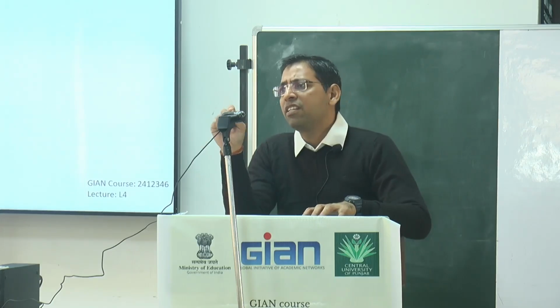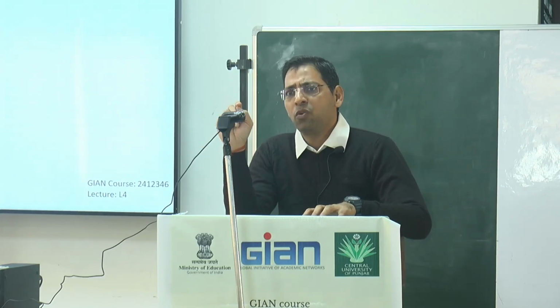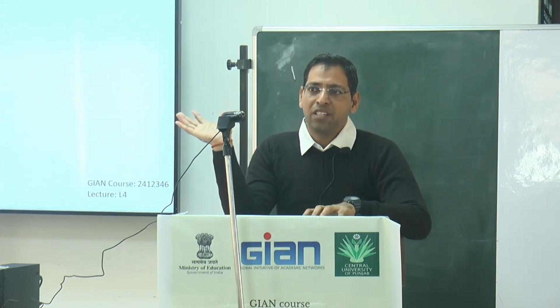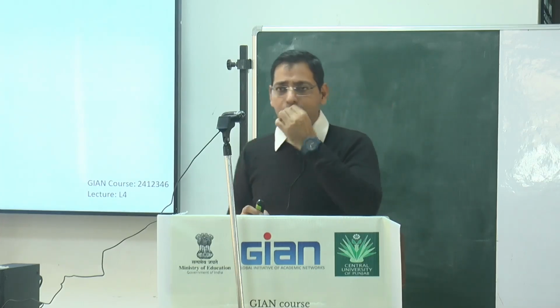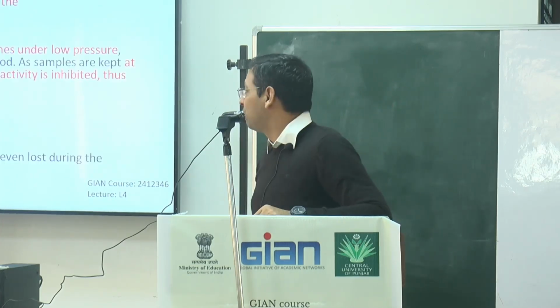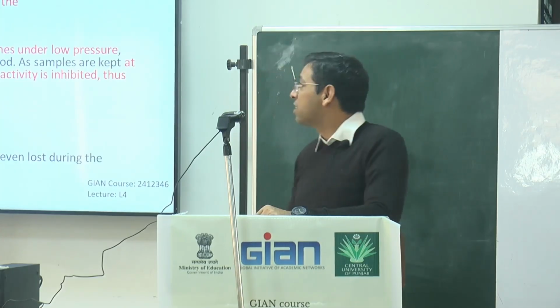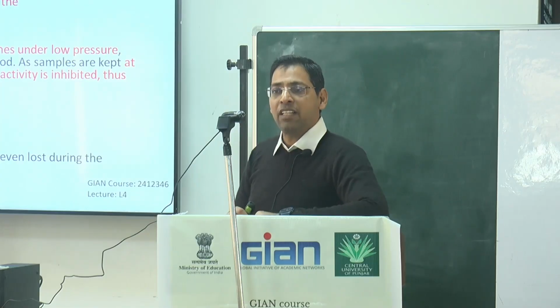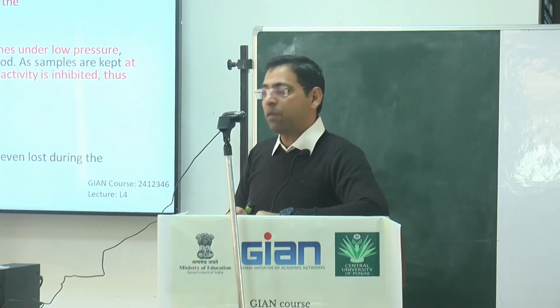A little bit of difference in the weight is very difficult to capture at a later stage. Otherwise, you have to use a robust chemometrics tool to normalize those cases. The other step is extraction, so extraction you have to do. They are two different things that come up here. This is the same thing that I told you about the water. And freeze drying is the method that we are using for this particular purpose.